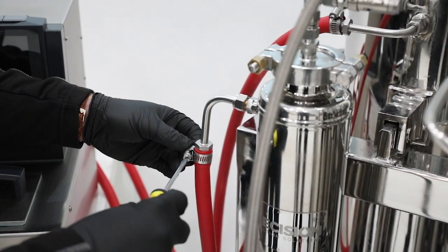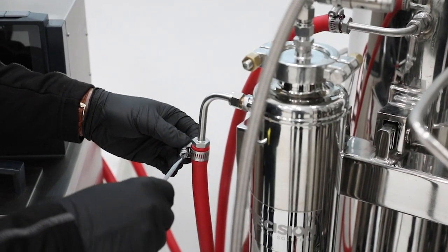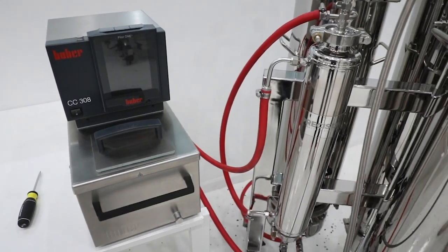Once you've connected all the hoses, you're going to want to go back over the system and tighten all the hose clamps. Once all the hose clamps are tightened, you're going to fill the bath up and turn the unit on.